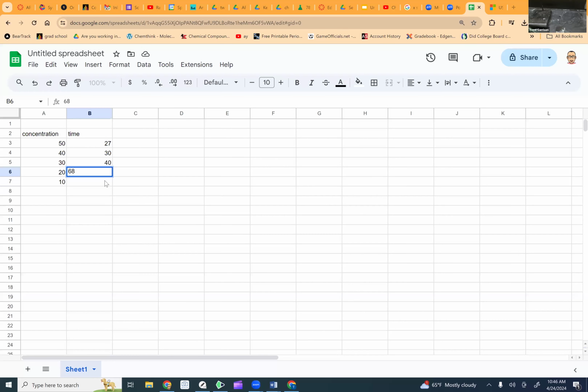And we are going to put that in there, 2:27. That is 120 plus 27. That's 147 seconds. All right, so now I have my graph. Let's go ahead and highlight not only the numbers, but the labels as well. And then come over here and we will push the button that gets us a graph, this icon right here, insert a chart.